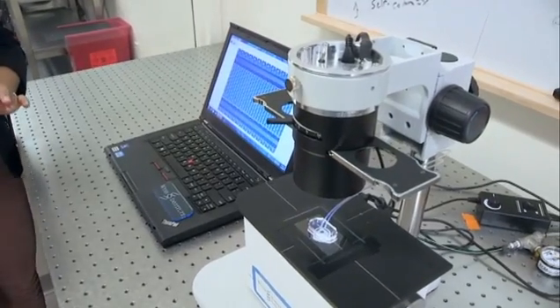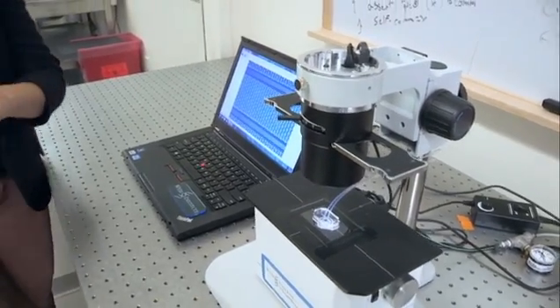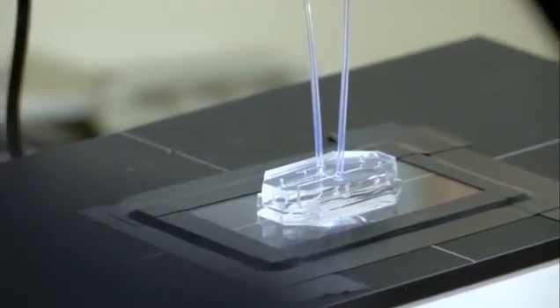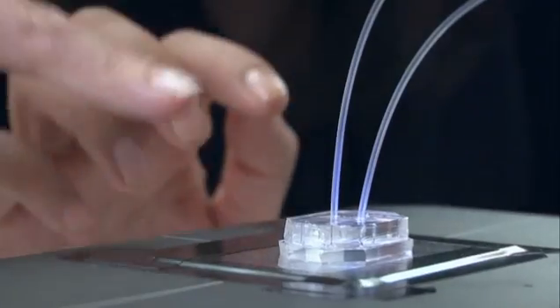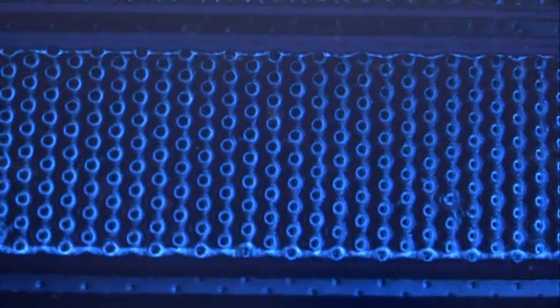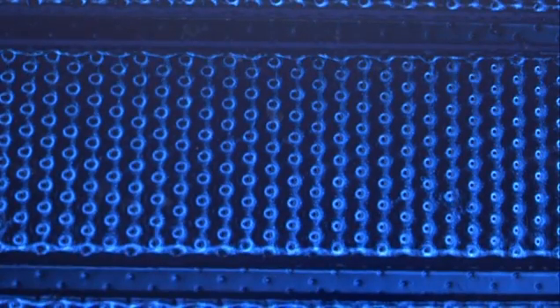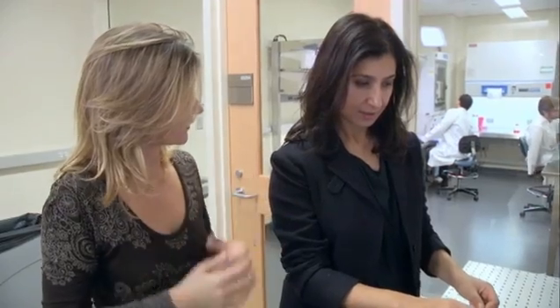So, hang on. So we injected the cells onto that chip, made it a lung chip. It's ready to be used. The cells are happy. And now we're actually... That's the results. We're actually seeing what's happening. And we're focused on the membrane in the middle and you can see the membrane contracting and relaxing, just like our lungs expand and contract as we breathe the air in.